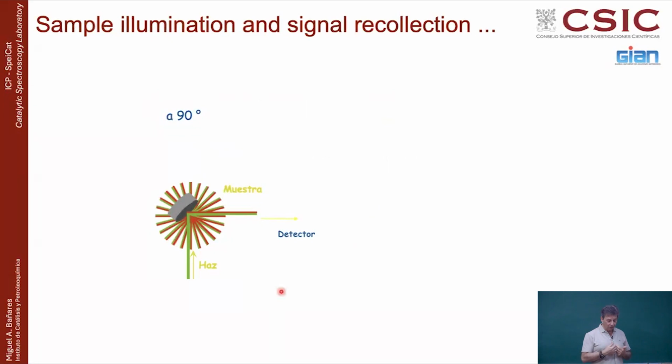So basically, what we used to do in Raman in the old times is that you make a pellet, which is flat, and here comes the laser. Here you have the pellet flat, and then you put it 45 degrees so that it will reflect preferentially towards the detector. I guess all of you have been playing with the sunshine and the light and the watch, taking the reflection somewhere over there.